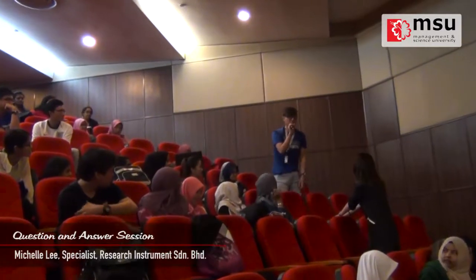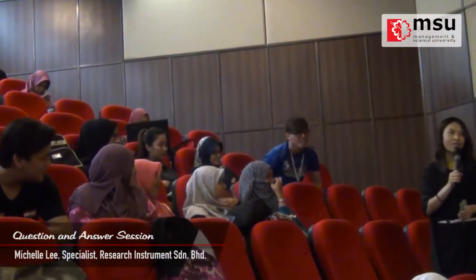Do we need to calibrate the machine, and how long should it take? All really high quality questions. So definitely all the instruments are calibrated even before they ship out from the manufacturer. And besides the sales team and application team, we also have the service engineer team that will do a yearly performance test to ensure that all the instruments are qualified, because they have certain standards to run and make sure they achieve the requirement. How frequent? I bet even in the industry they do it once a year, depending on how stringent your requirement is.